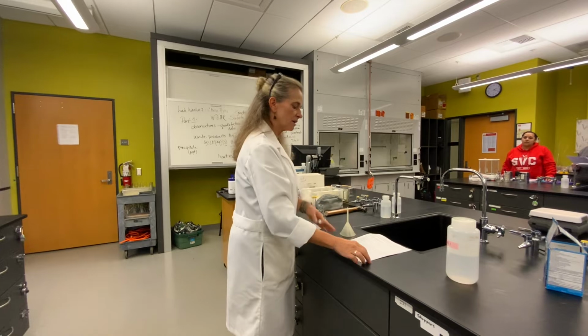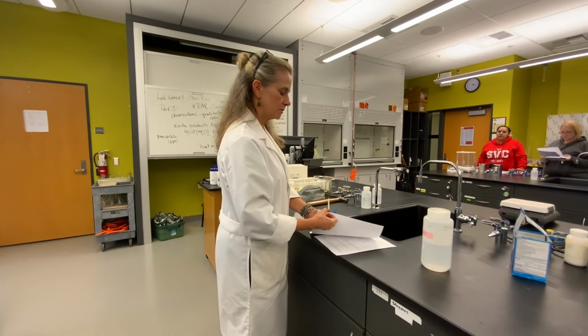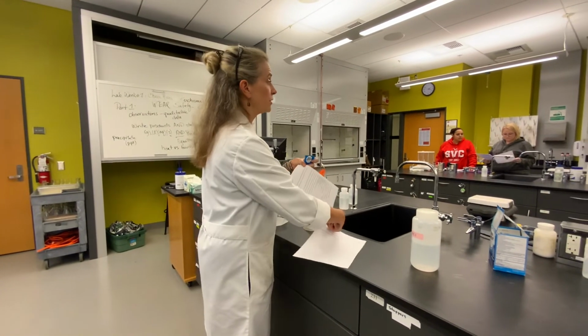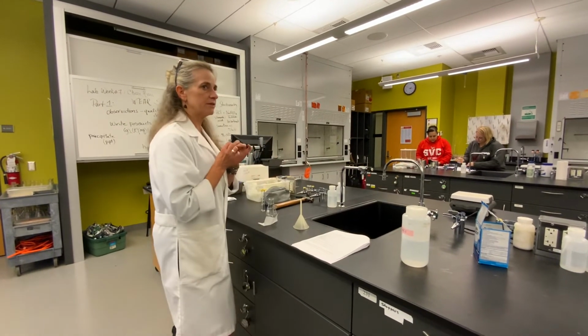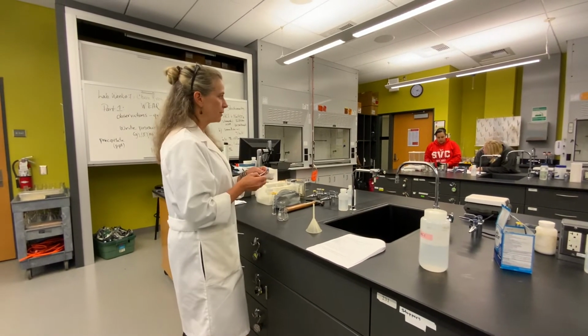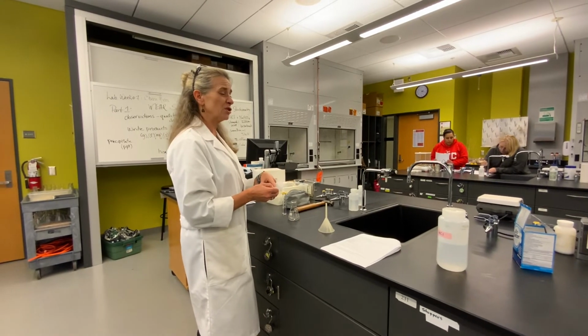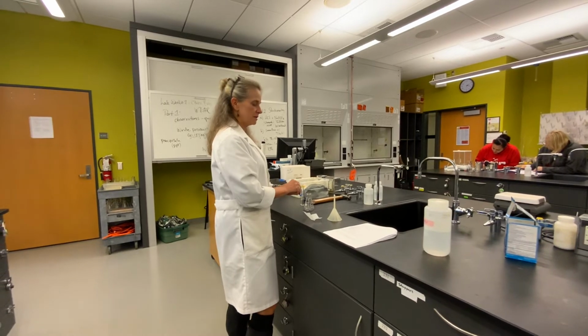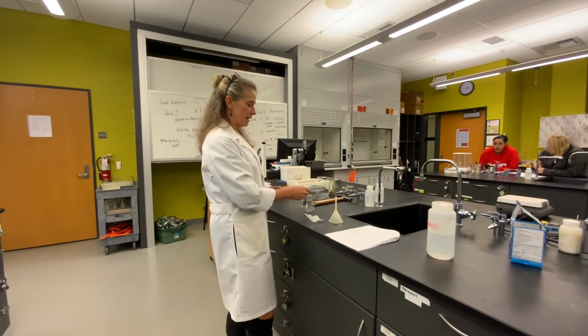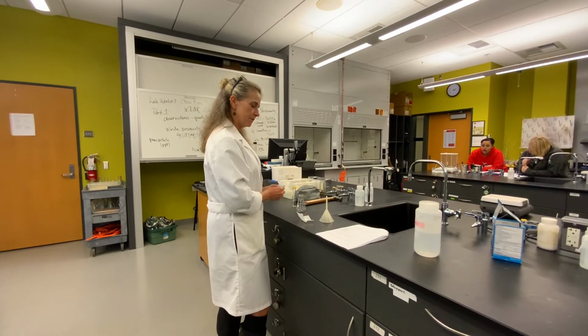So again, if you look at the second table, there should be a place where you can put the mass, okay? So you're going to put the mass of the antacid tablet this time. So put it on weighing paper, and I encourage you to put it on weighing paper because you're going to use it in a second. So on the weighing paper it goes. Just tear out the weighing paper. You guys know how to do that. Get the mass of the tablet, all right?